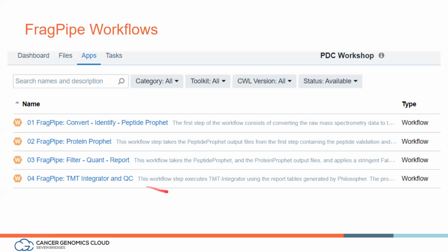Now, quality control is an R notebook that Felipe made. So we're going to run the R notebook as a tool in this workflow, but also interactively in our studio, so you can customize it. And we'll show you how to do that.